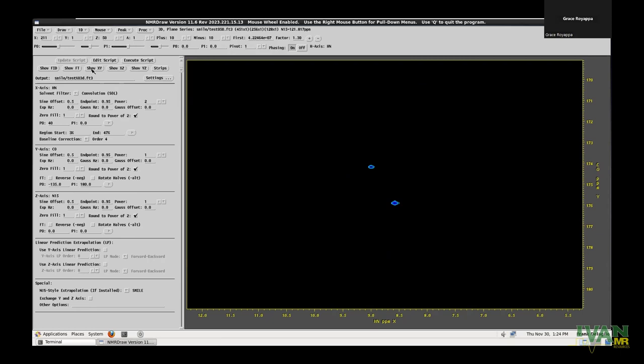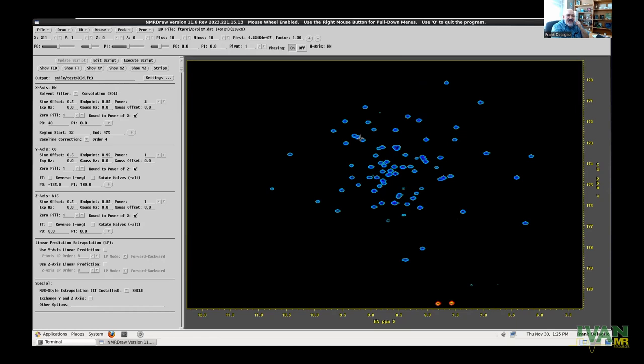Right, so this is an excellent question, and we covered these details in our discussions about non-uniform sampling. The critical thing to keep in mind is that however you do the measurement, the number of increments that you need in a given dimension has to be sufficient to describe the largest number of signals that you expect in the data. For example, if you had a 2D NOE spectrum and the most crowded column had 30 peaks in it, it wouldn't be suitable to measure that data with just 16 increments, right? Because 16 points is not enough to define 30 different NMR signals.